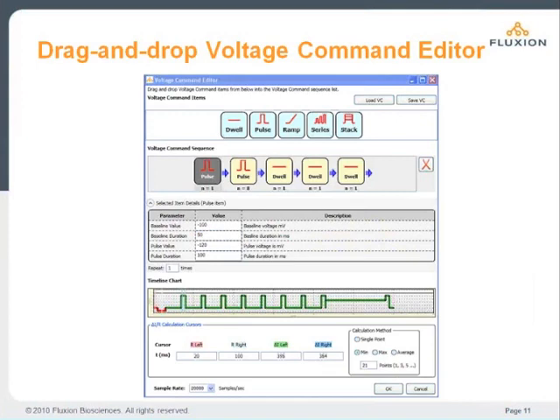for the event, such as the baseline value, baseline duration, pulse value, and pulse duration, and the number of repetitions of the pulse. In the timeline chart, the event being edited is highlighted in red. In this case, the small hyperpolarizing test pulse that we are running to evaluate the membrane resistance is highlighted. As well, we can set real-time cursors, which will be monitored as the experiment progresses.